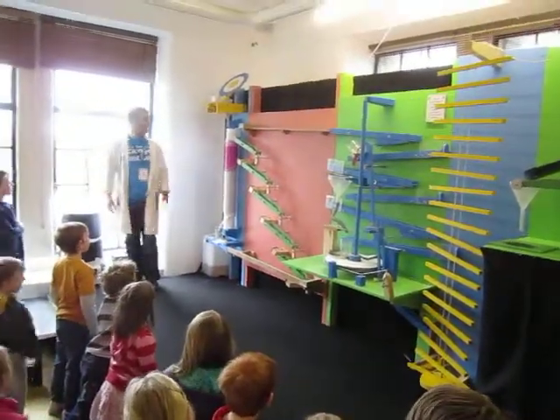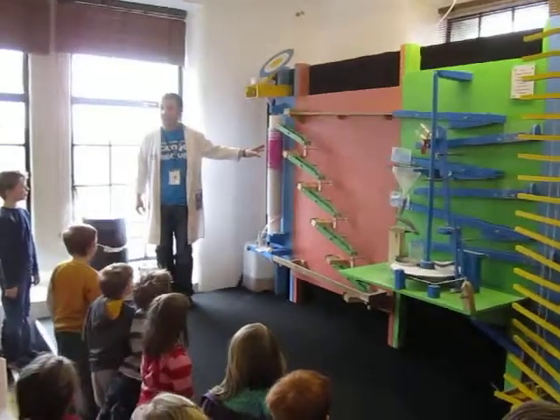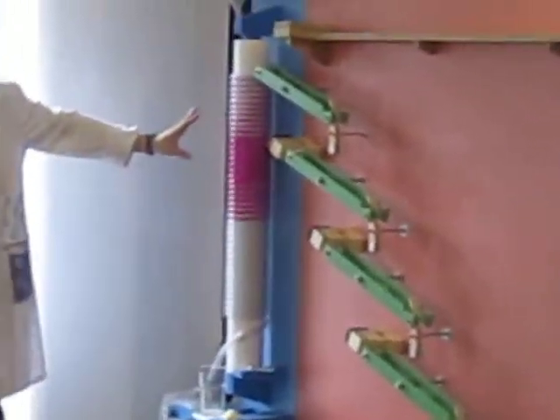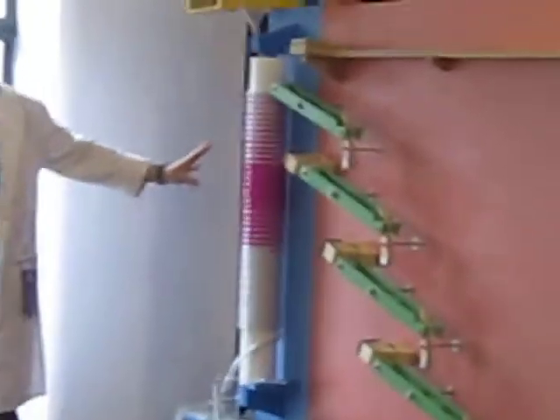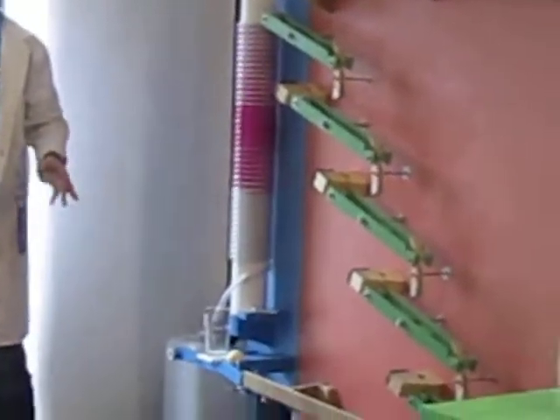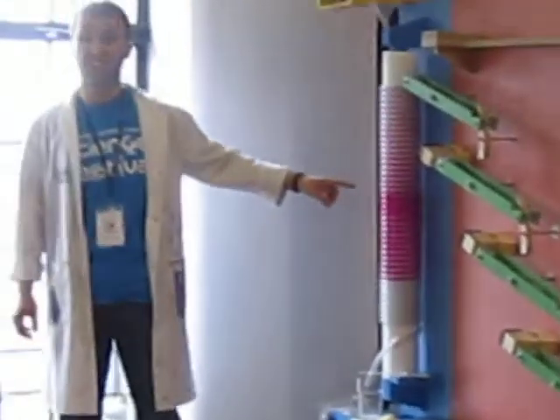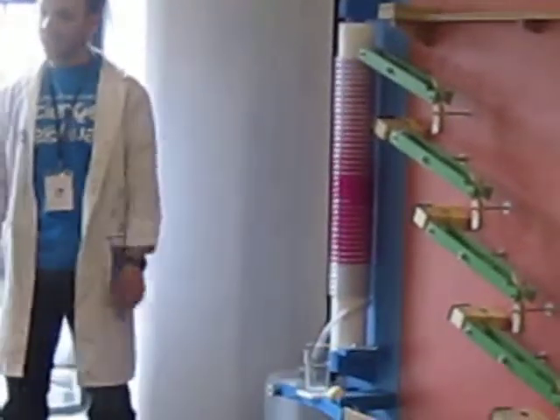We are starting off with an alkaline solution of sodium hydroxide in here. This is called pink because I have added an indicator to it. The indicator is called phenolphthalein. It is pink in an alkaline solution, but when it becomes acidic, it will turn to a colourless liquid.